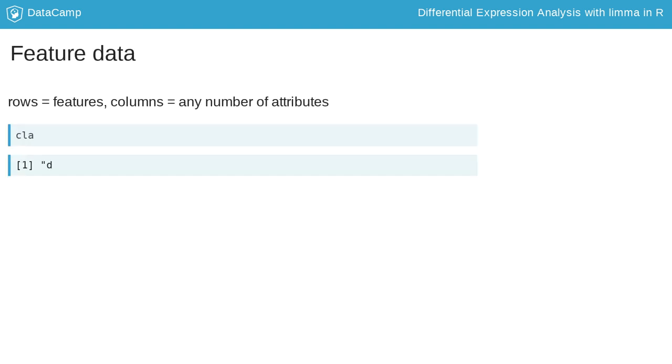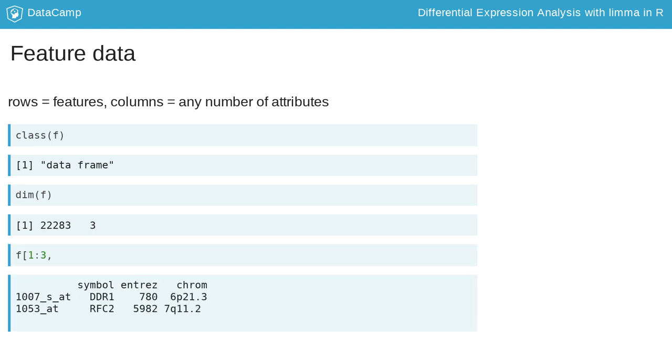The feature data is a data frame with one row per feature. Thus its number of rows is equal to the number of rows of the expression matrix. The columns describe the features, in this case genes. Here the columns correspond to the gene symbol, the database identifier, and the chromosomal location in the genome.